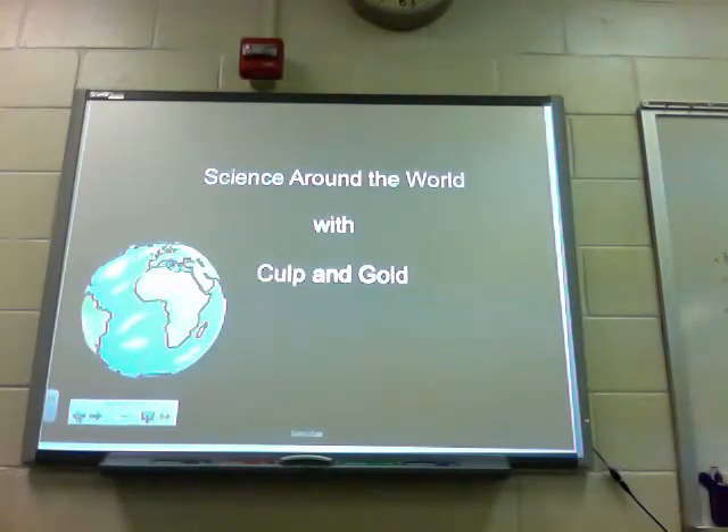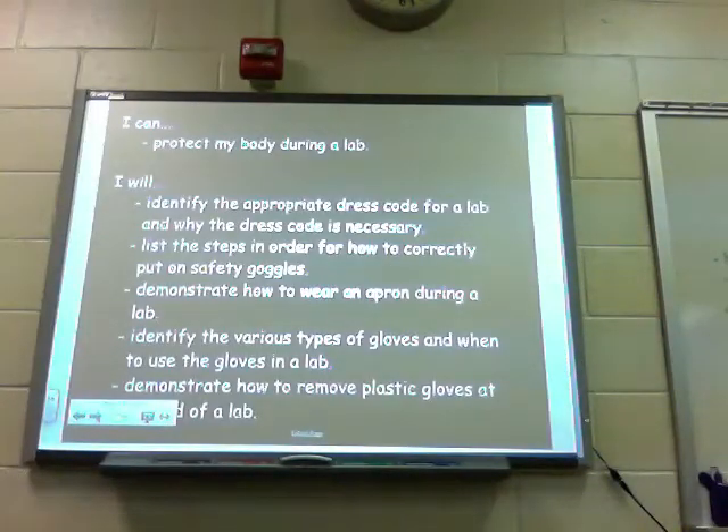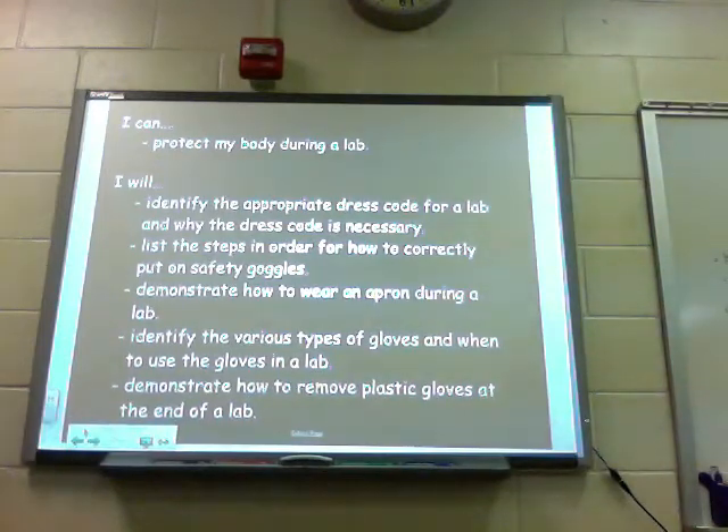Thanks for joining us for Science Around the World with Culp and Gold. Today we're going to talk to you again about protecting your body during a lab. I can protect my body during a lab. I will identify the appropriate dress code for a lab and why the dress code is necessary. I will list the steps in order for how to correctly put on your safety goggles. I will demonstrate how to wear an apron during a lab, identify the various types of gloves and when to use them, and demonstrate how to remove plastic gloves at the very end of your lab.